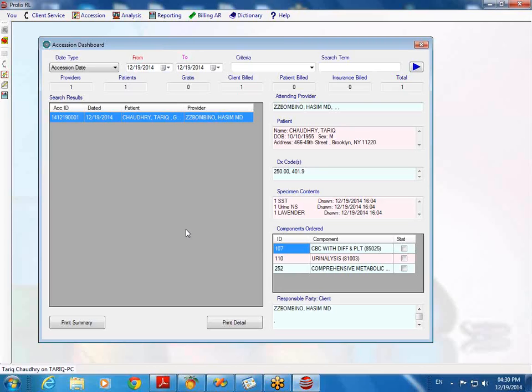So that's kind of like the number of individuals that can simultaneously access the system, or is it actual physical copies of the software that we're installing on different workstations? No. The software is all central. This is how many computers can be hooked up to the system. Seats mean the computers, PCs. Those seats are license based, and we can provide you 10,000 licenses. You could buy 10,000 licenses, and you could have 10,000 computers associated with your network, and it will work.